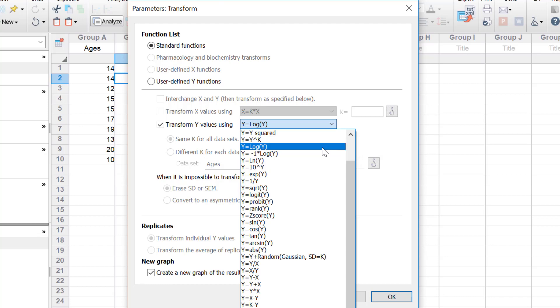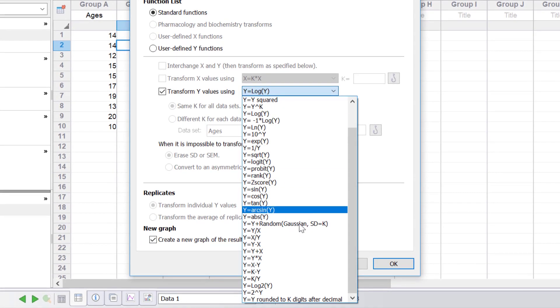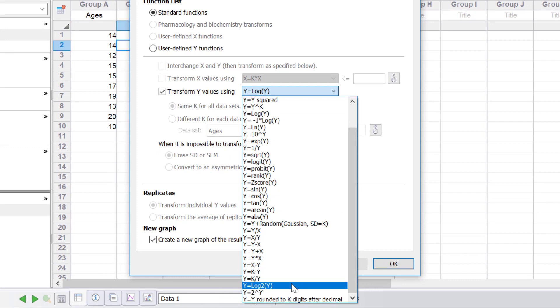If you want to do a log transformation with the base of 2, there is also an option that says y equals log 2 y.